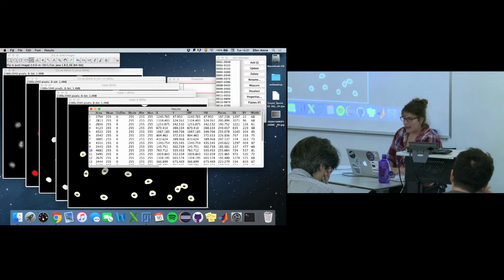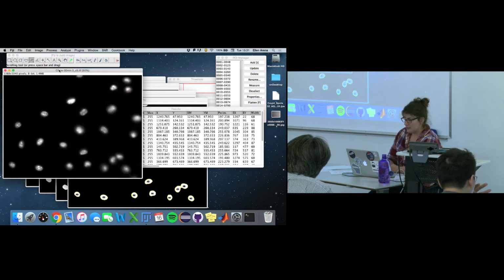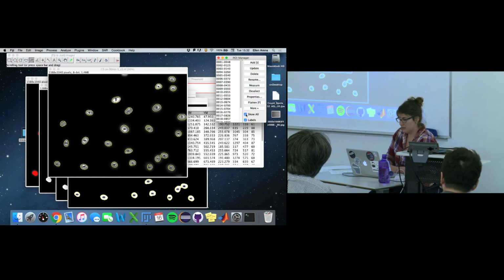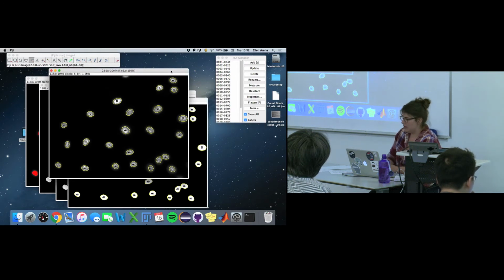So if you just go back to your original data set, get that guy to the foreground, and go into your ROI manager, and you can toggle again that show all option and overlay your ROIs onto your original data set. So now I'm just going to delete these old results because we don't care about those. Those were a mistake that I accidentally did on my binary image. And now again, we want to measure. Now we really want to measure. So we're going to deselect, again, just to be sure we're not selecting individual ROIs, and then measure. And now I've got my real data set.